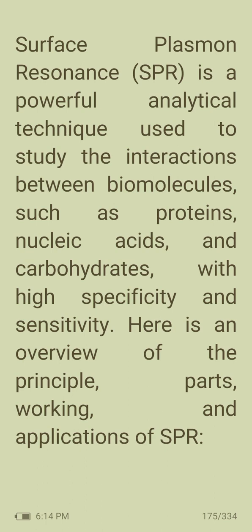Here is an overview of the principles, parts, working and applications of SPR. What is SPR? It is used to study the interactions between biomolecules with high specificity and sensitivity.